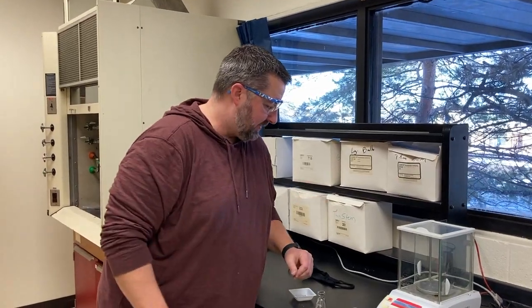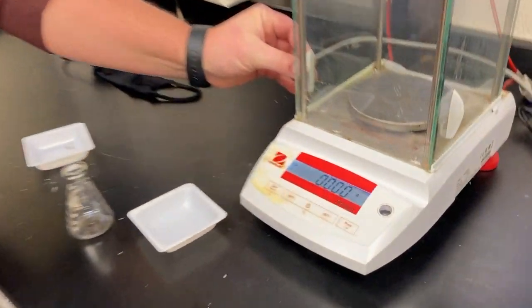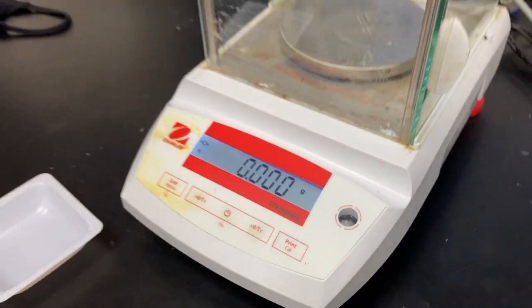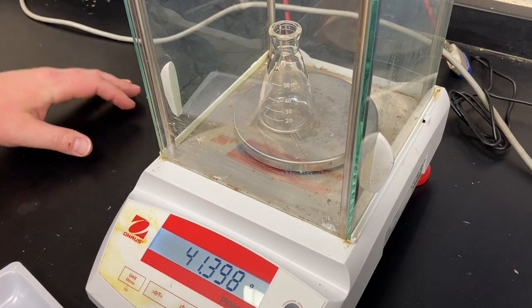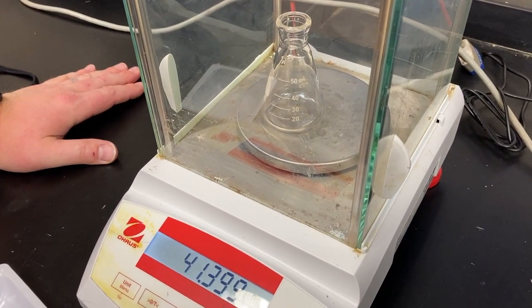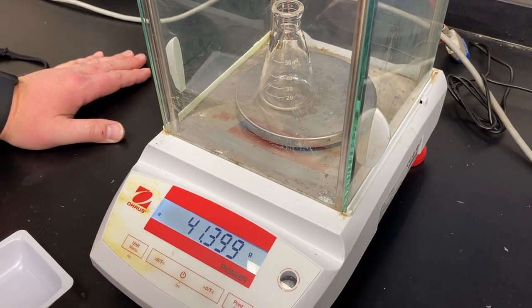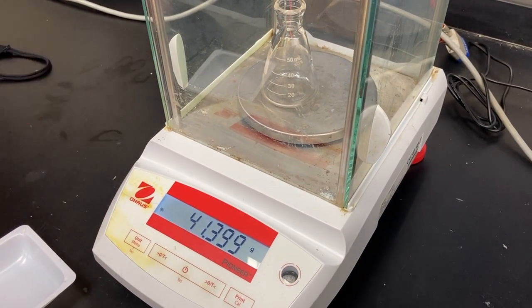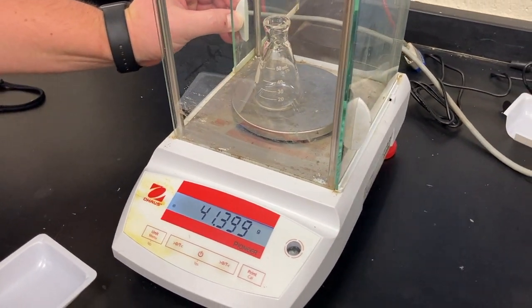Okay, we're here at our analytical balance. It's set to 0, so we're ready to go. We're going to put our dry, empty flask. That's the noise that this analytical balance makes when it's weighing something. 41.399 grams. So we want to record that in our data table. That's the mass of our empty flask, 41.399 grams.